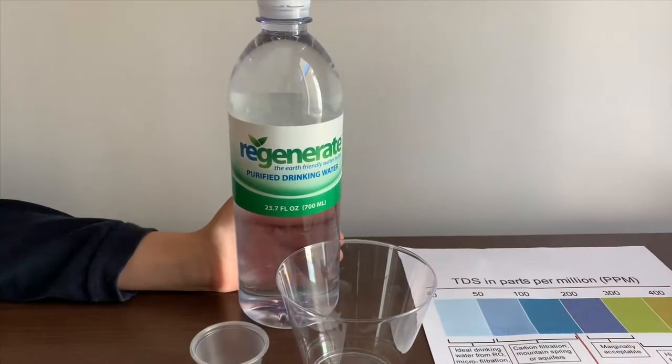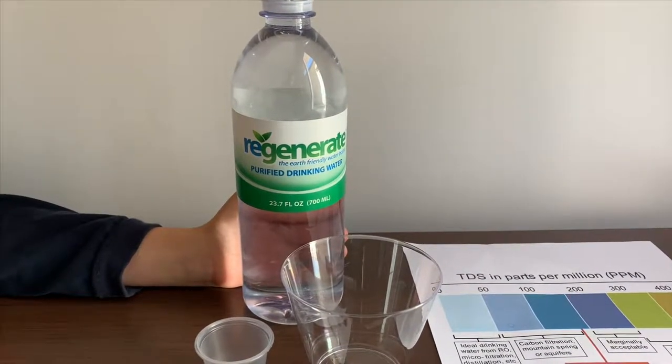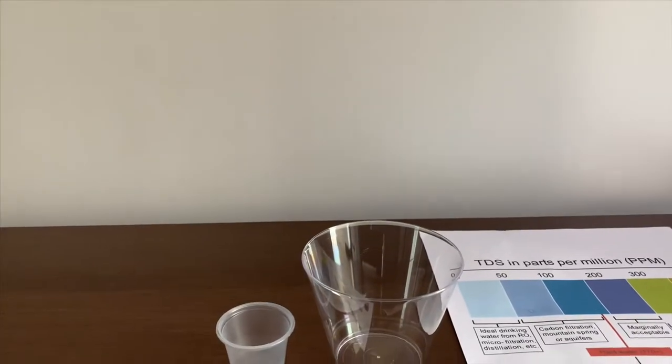This is Regenerate Purify Drinking Water. It's from municipal sources and it's filtered. Let's test the pH and TGS levels.